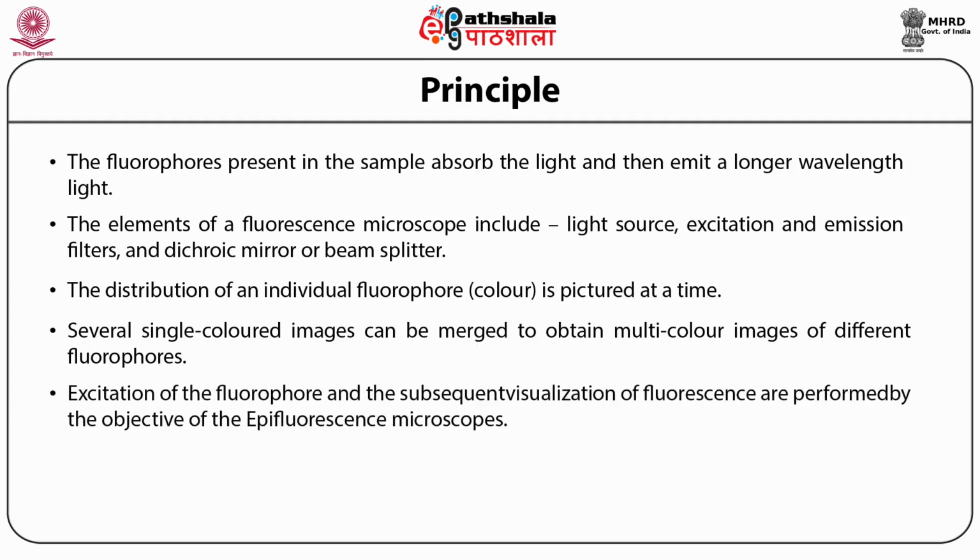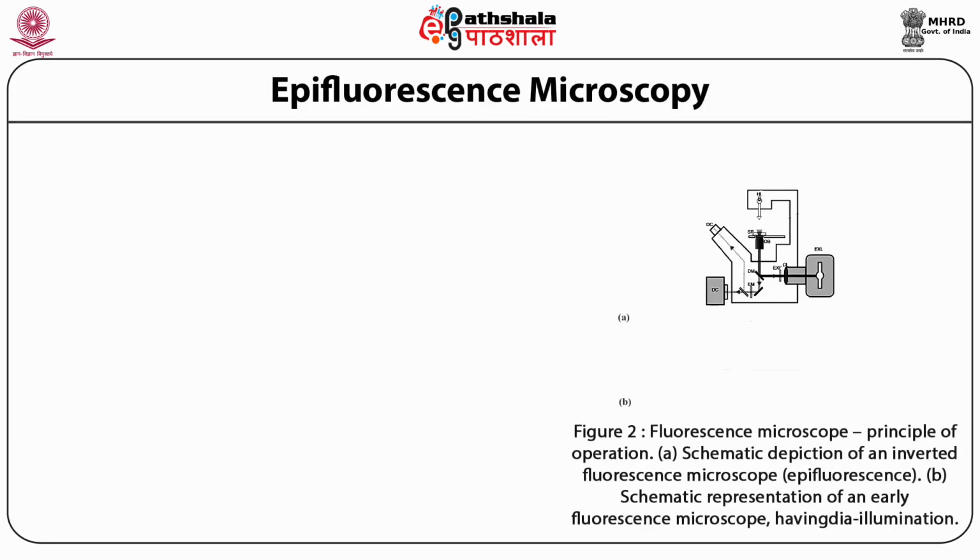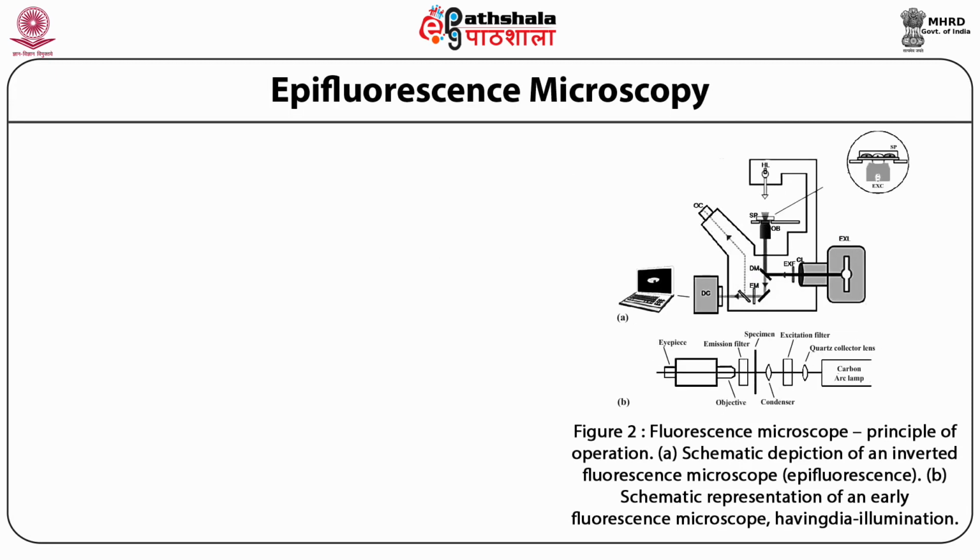Excitation of the fluorophore and the subsequent visualization of fluorescence are performed by the objective of epifluorescence microscopes. Advanced microscope designs include the confocal microscope and the total internal reflection fluorescence microscope, abbreviated as TIRF. Let us now discuss epifluorescence microscopy in detail.